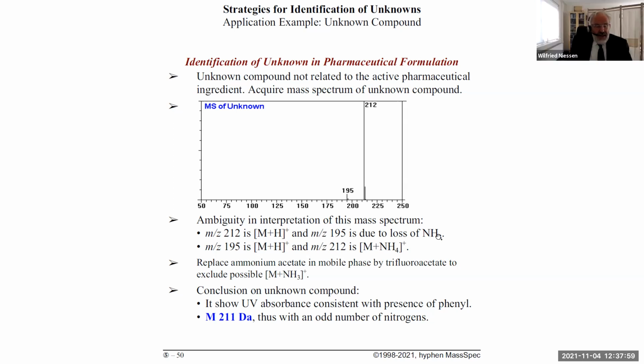This is a possibility, but it was not done, so I don't have the data. And I expect you don't get data for the negative ion mode, but I cannot be sure because it hasn't been done. But that would be a good idea. I like doing both positive and negative ion mode, but most people stick to the positive ion mode.